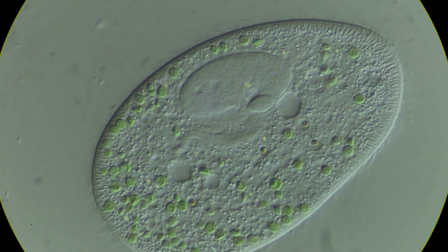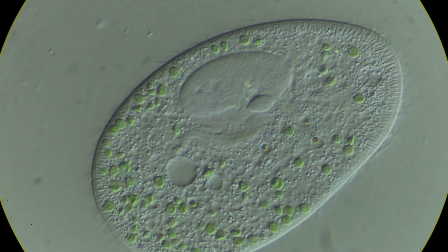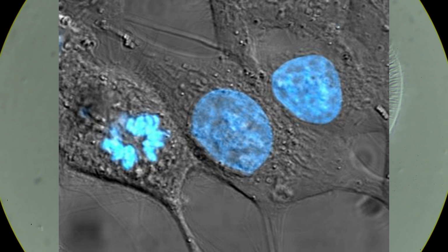In terms of those compounds, there are three major approaches, and they cover what we've described so far, those being stains, immunofluorescence, and proteins. With that, let's go through each. The stains are arguably the first and easiest to understand, as they are quite literally a case of having a liquid, just like with clothing where you apply it and it alters the appearance.